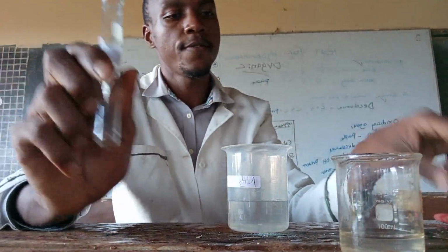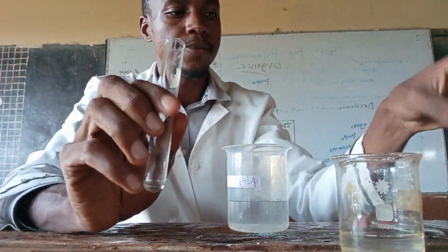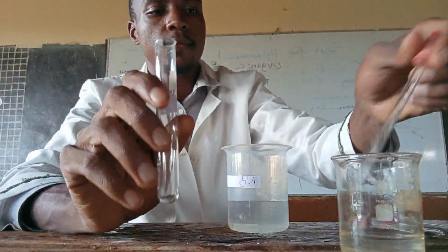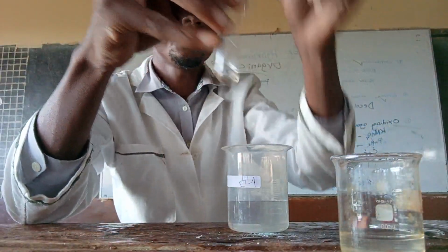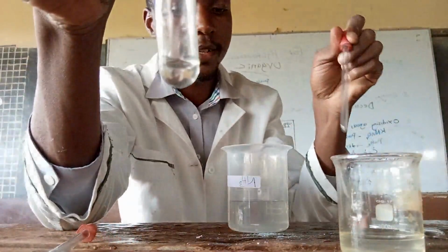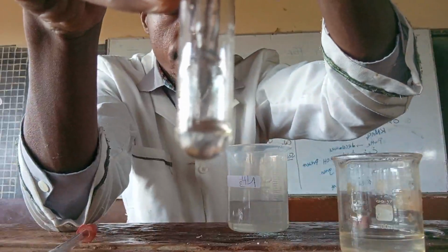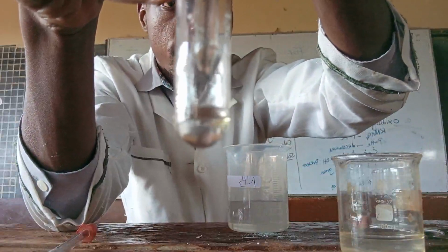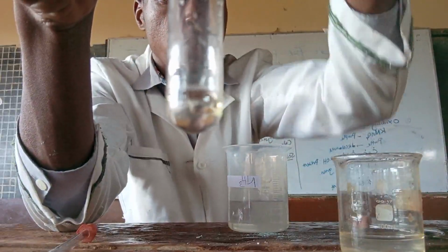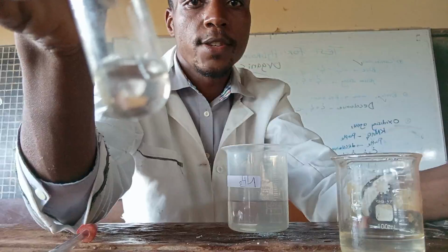Now, let's see how calcium will behave if we added ammonia. So, this is my calcium sample. And then I add 3 drops of ammonia. Nothing. No change. 3 drops and my solution is still colorless.